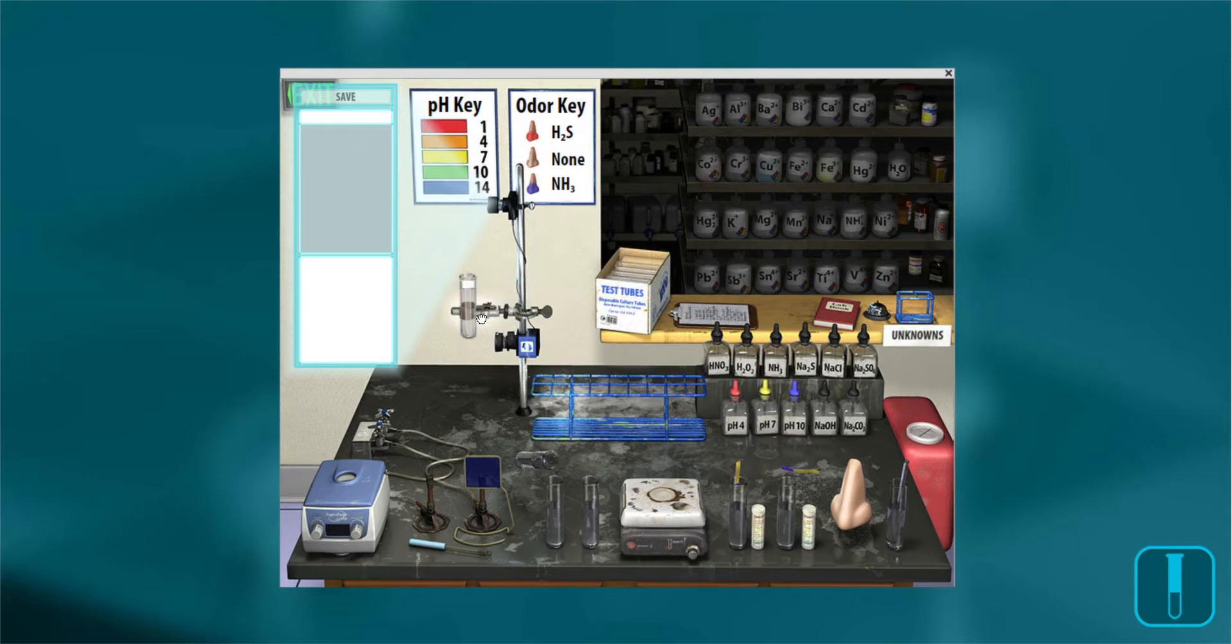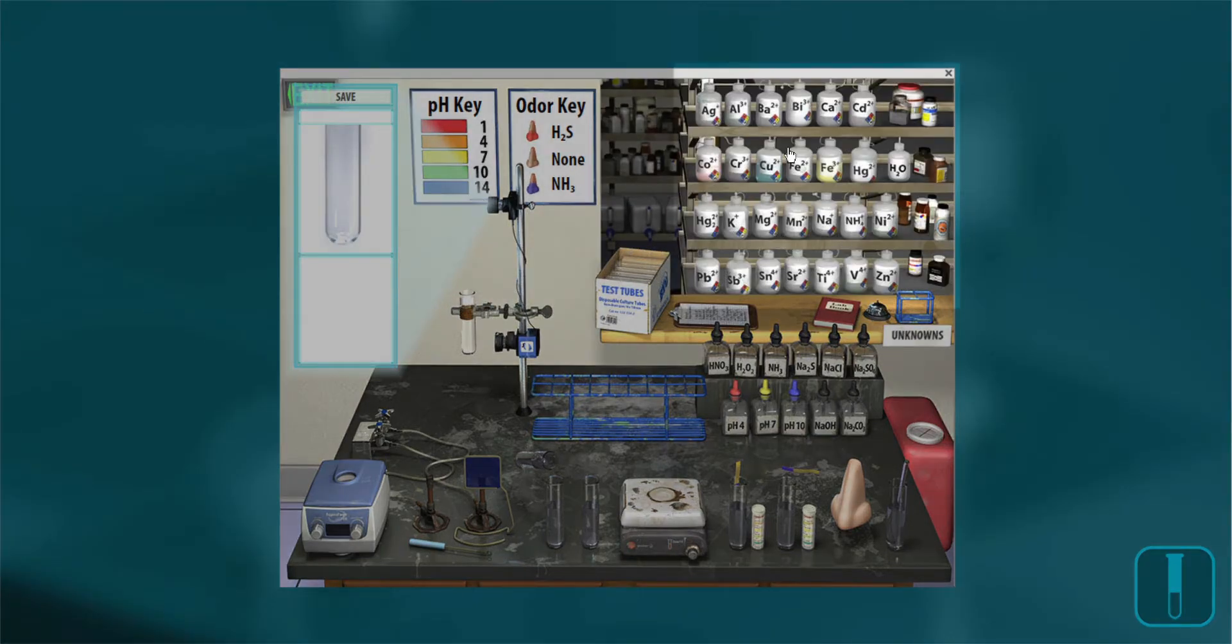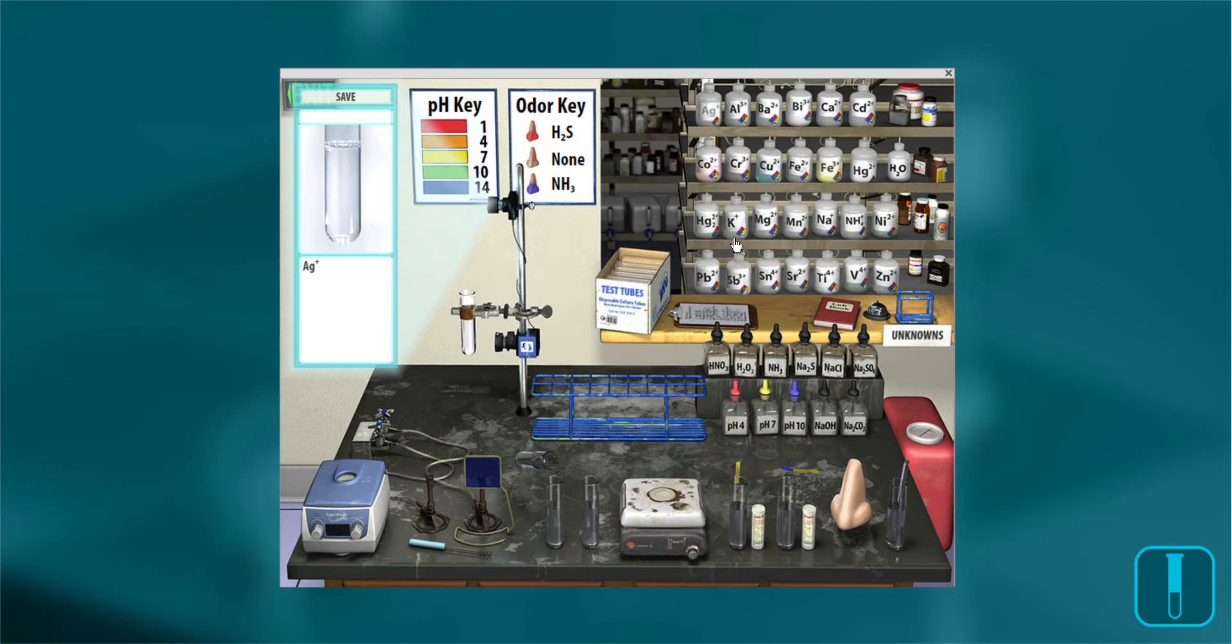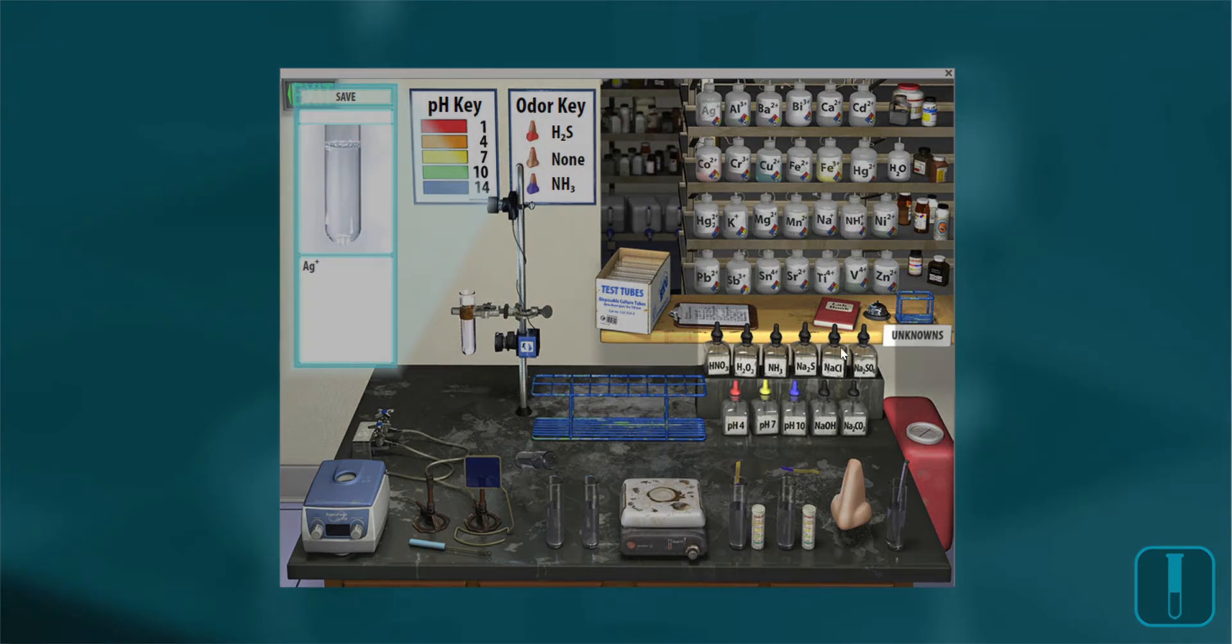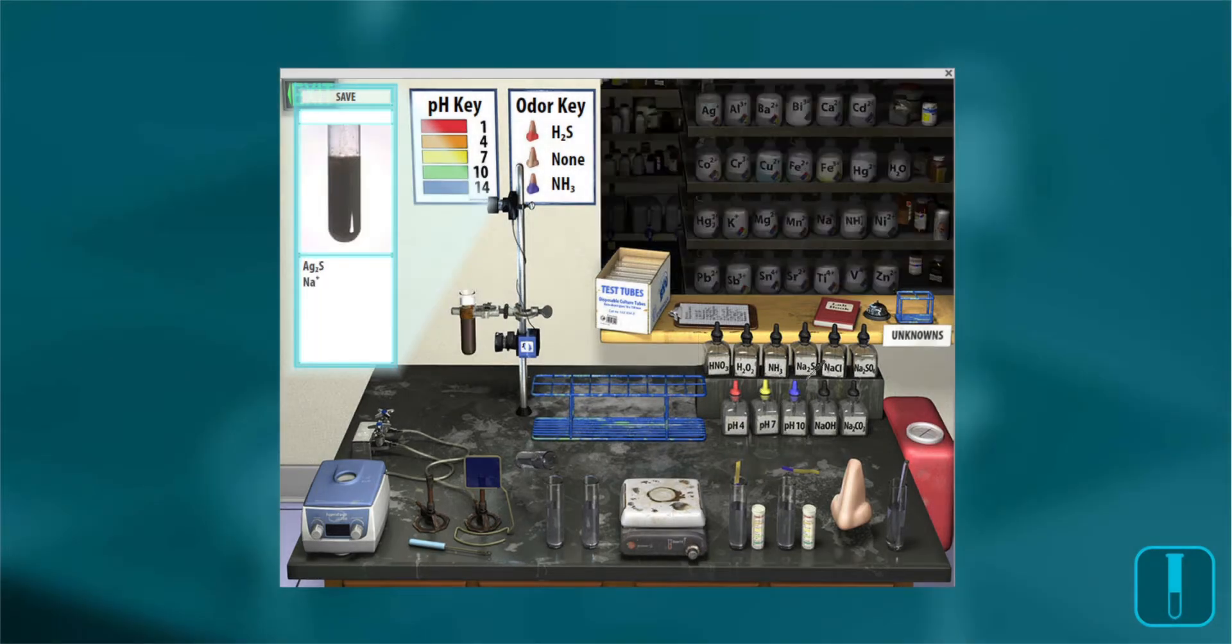Have your students select a test tube and add any cation you want them to learn to identify. For example, if I add silver, they can add any anion. If I add sulfide, we see from the characteristic color that a precipitate has formed and a reaction has occurred.